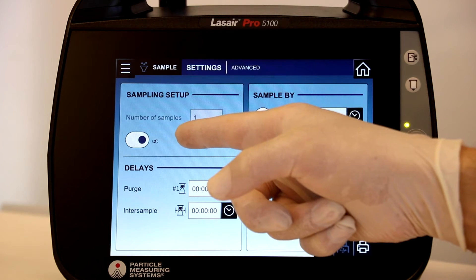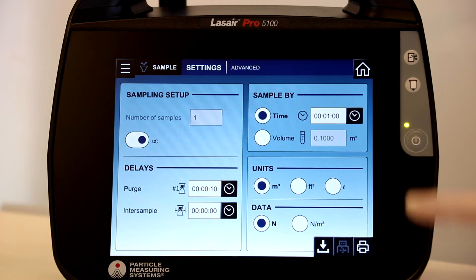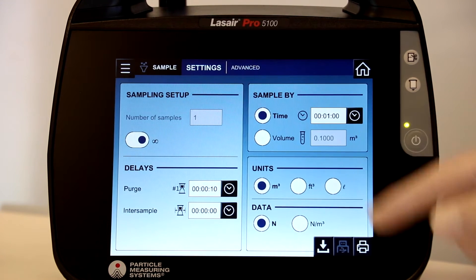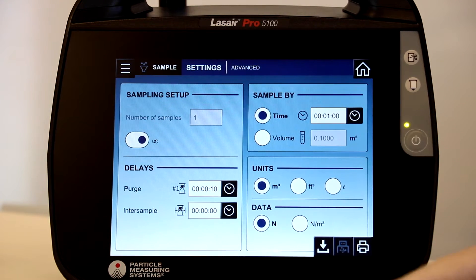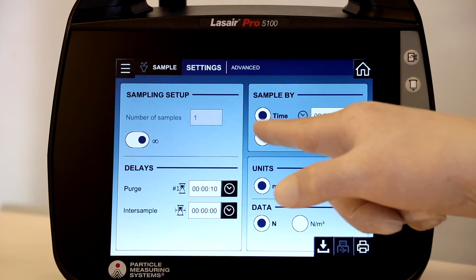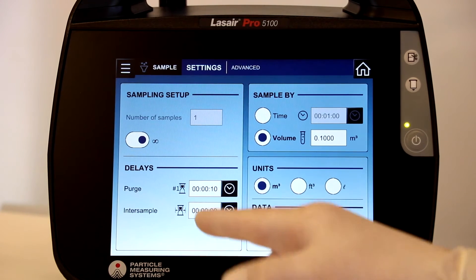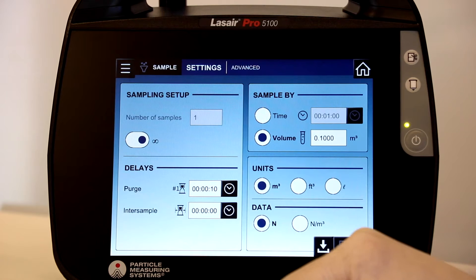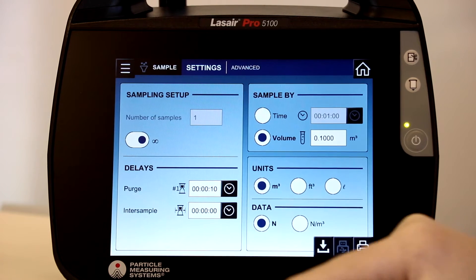Next, you can choose the preferred sampling method, such as time or volume. After this, we'll adjust settings for purges before samples and inter-sample delays.